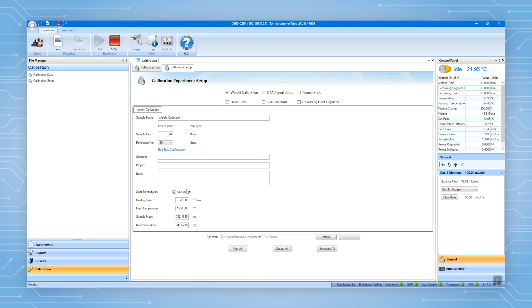Check use current as the starting temperature or enter the desired start temperature. Enter the heating rate and the final temperature. Input the masses of the two calibration weights.